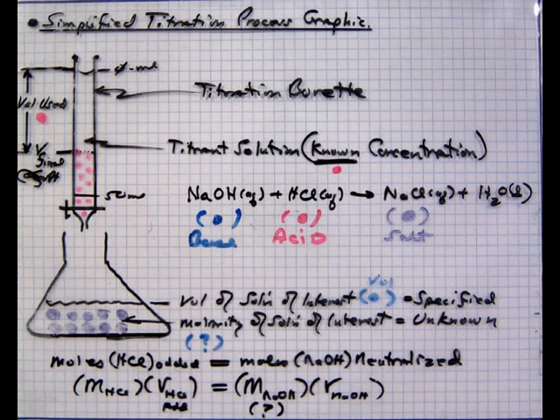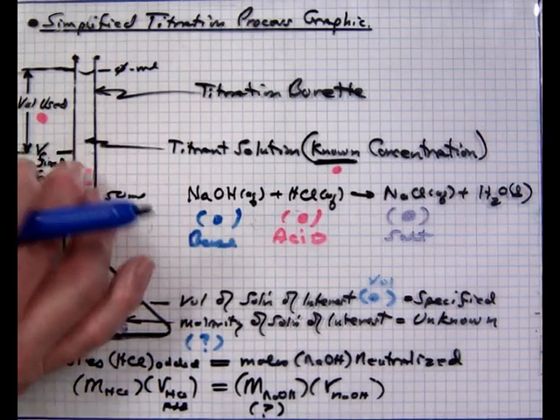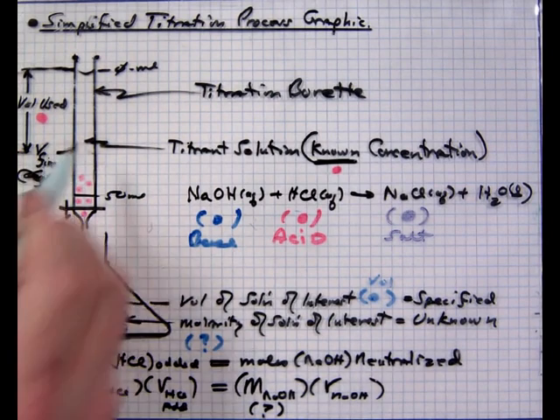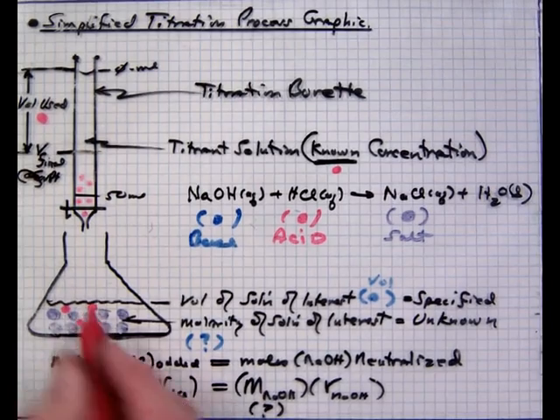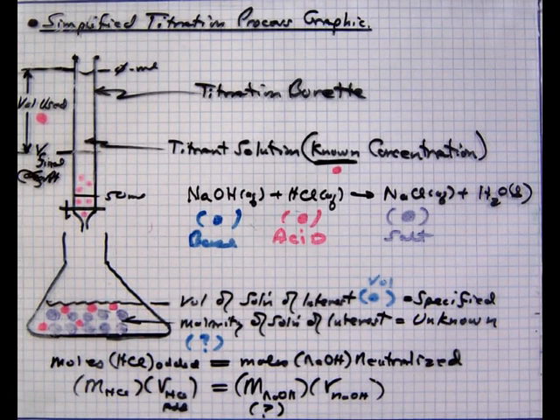There's one other little element that I want to share with you here. If we continued to put additional acid in from this point on, after that point, there would be nothing for the acid to react with. It's not going to react with the salt. So we would have just some excess acid in the system as we put extra acid in the salt.